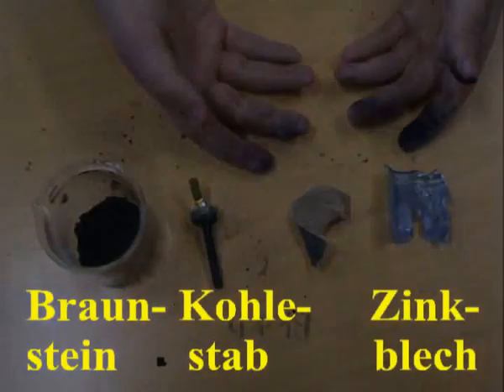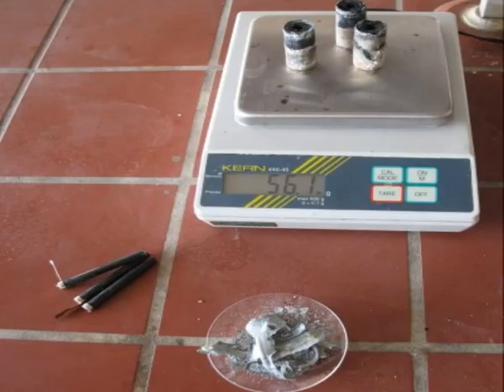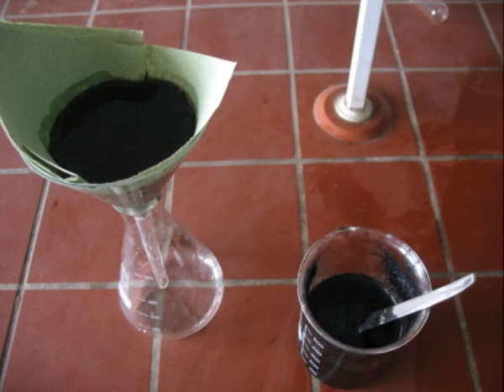For this experiment I used a zinc-carbon battery from 1992 which was completely corroded. The black mass containing the manganese oxides weighed 56.1 grams. Break the manganese oxide to powder, wash it with water and filter.